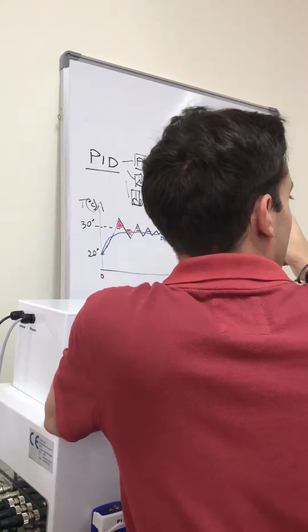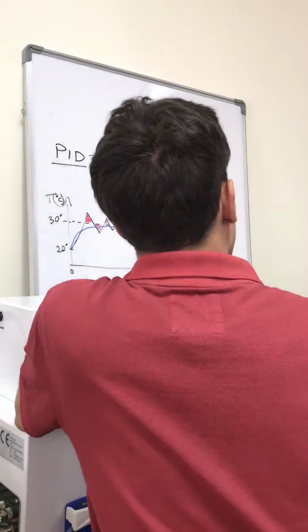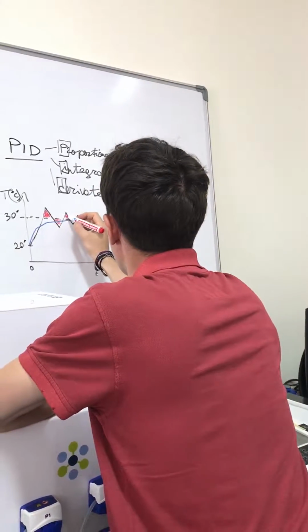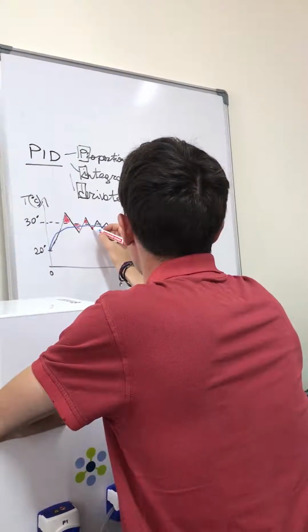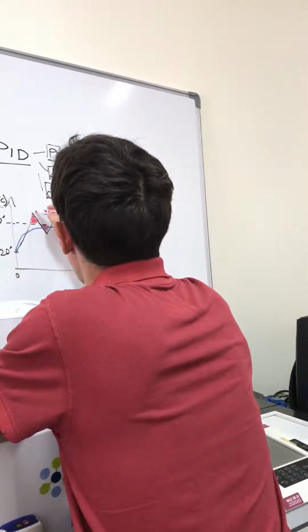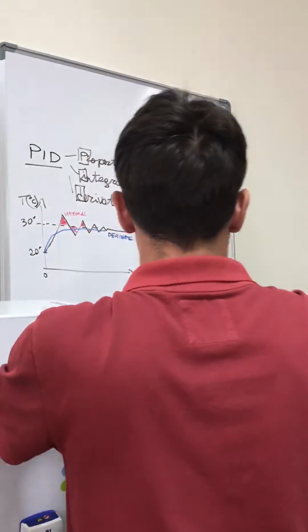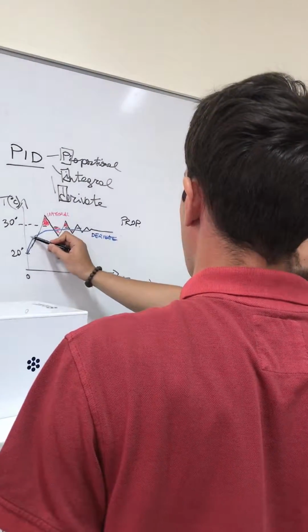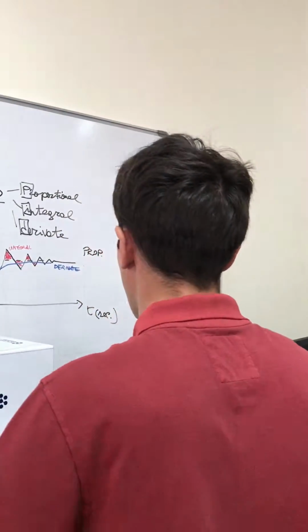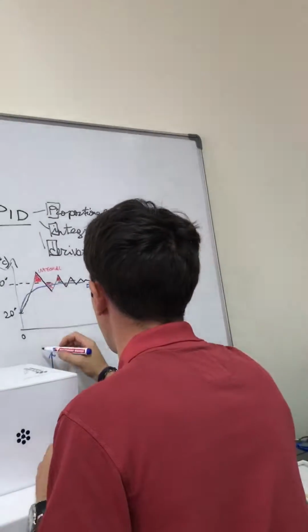It tries to null the differences, to reduce the difference to 0. So we are going to end up with a line. The real line you will see is the merge of these three.